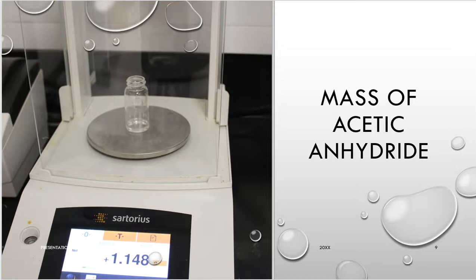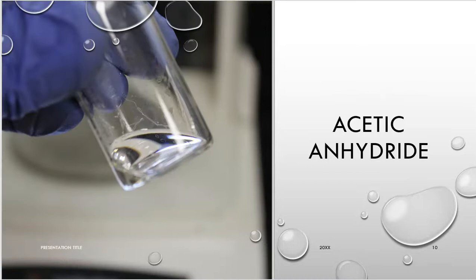So the acetic anhydride is a reagent that's going to be used here, and that acetic anhydride, again, is from a tared container, and I've directly added the acetic anhydride to that container when I did this, and that is 1.148 grams. So 1.148 grams of acetic anhydride will be used in the particular lab experiment that we're doing together.